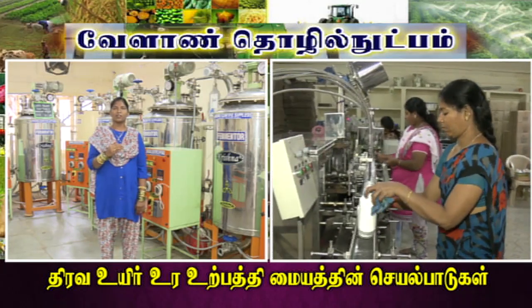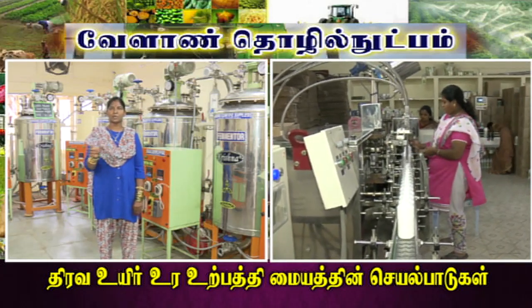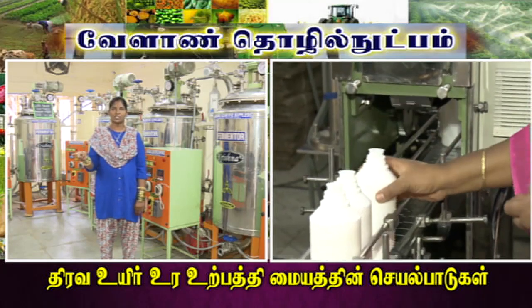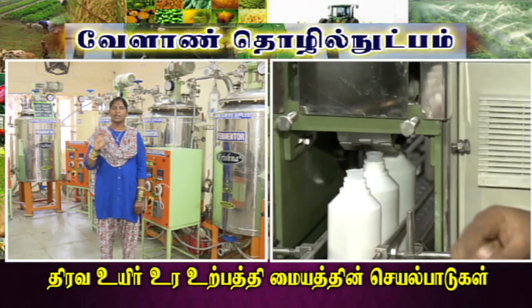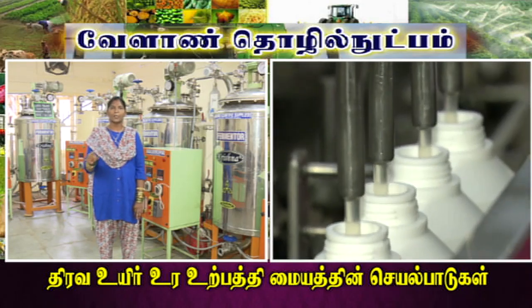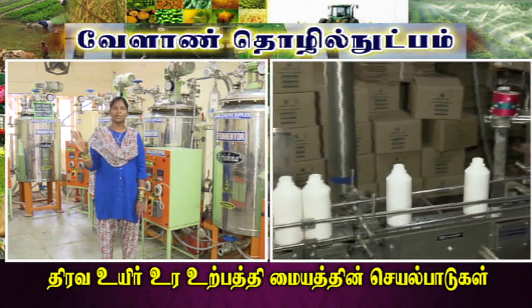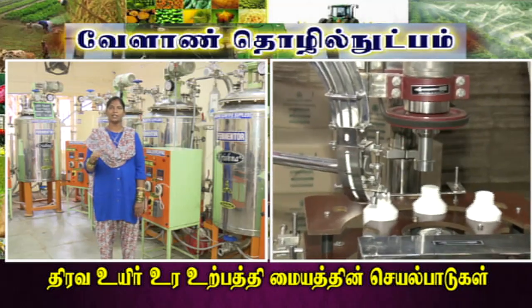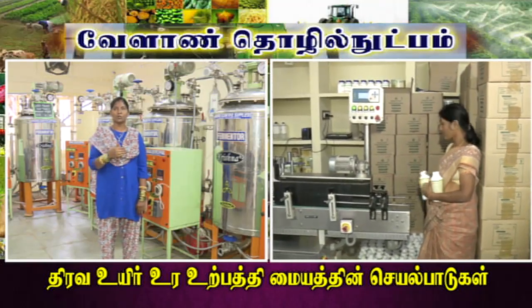For the packaging unit, there is an automatic filling machine. First, we place the bottles. In the bottle, there is a capping machine, a sealing machine, and labeling — this is a continuous, fully machine-operated process. When we place the bottle, the labeling is ready. Once the final product is ready, we pack it in a carton box for distribution to each AEC center.